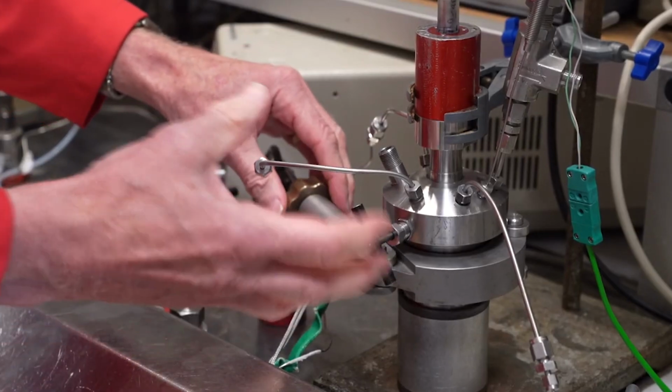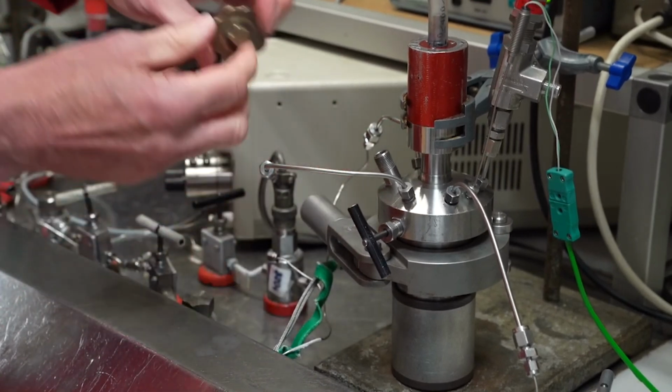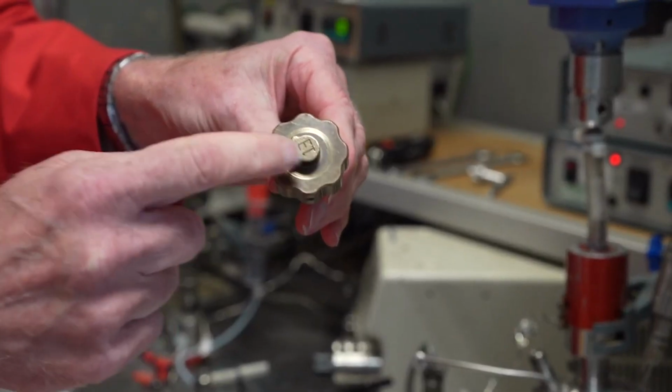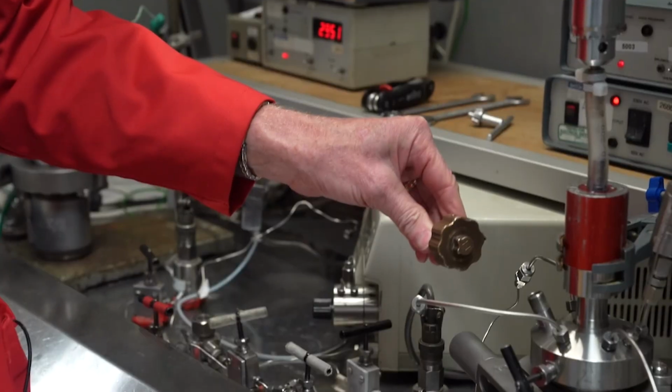All right, so now I mentioned the clamp. Here's how we just tighten it up, and I've got everything ready. And this is our unit here for tightening it up. Notice that we've got here a fairly unique shape, and this key only fits in this clamp.